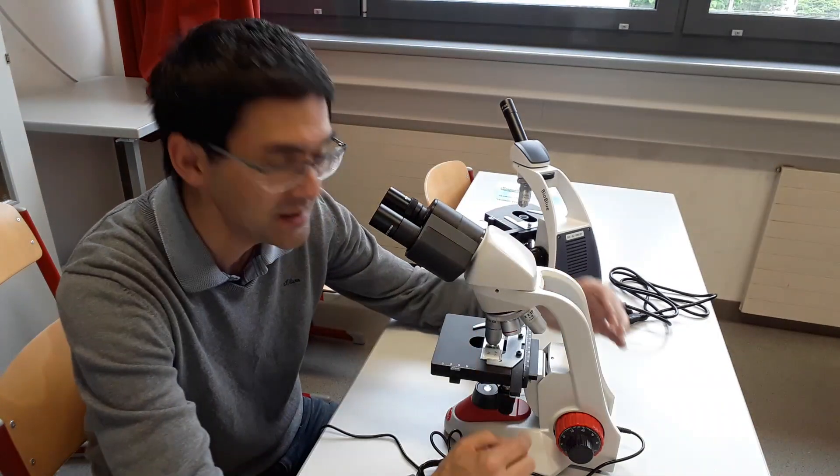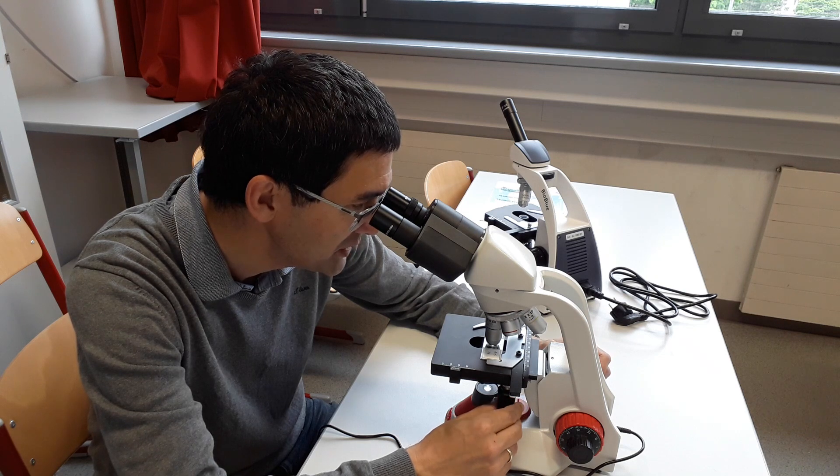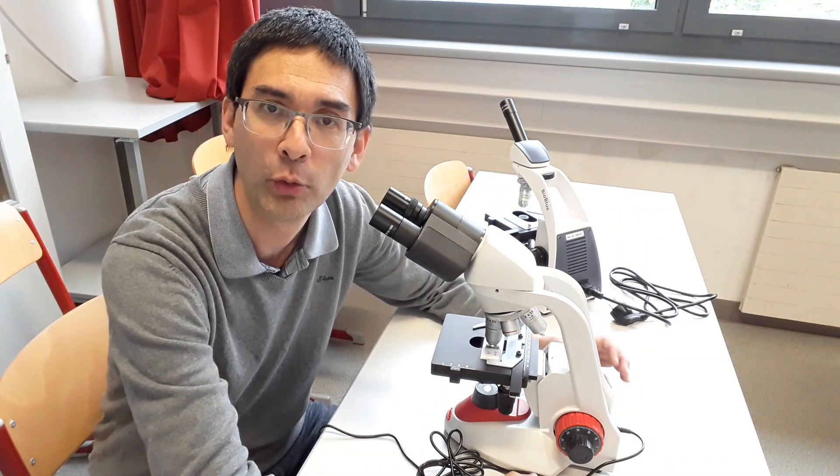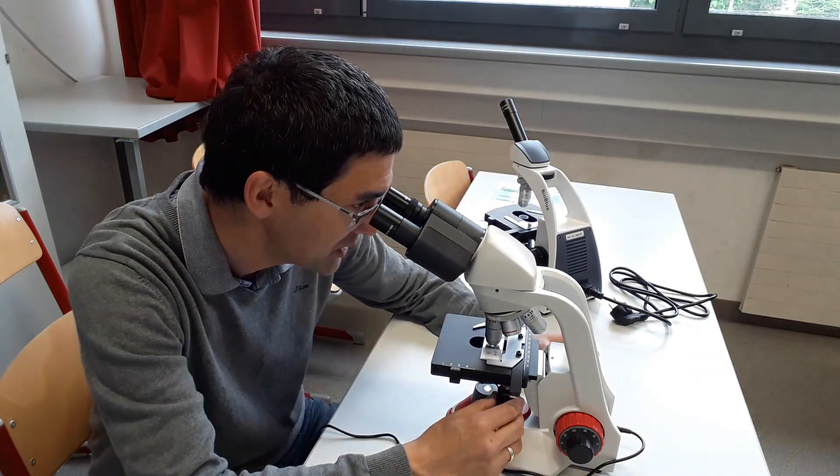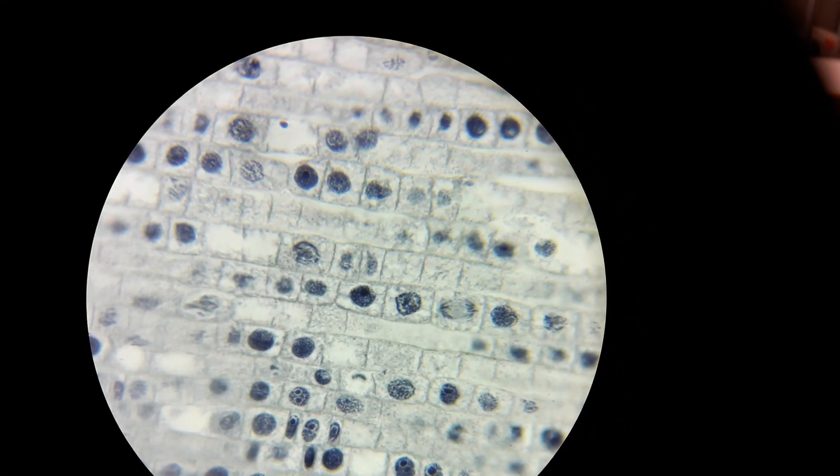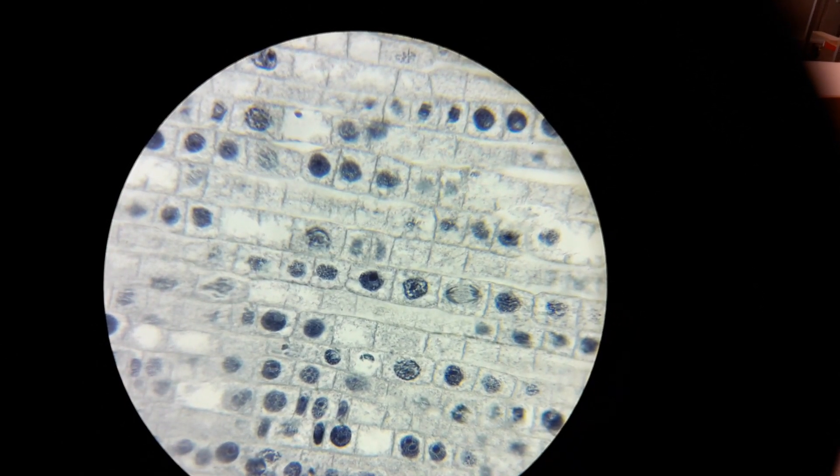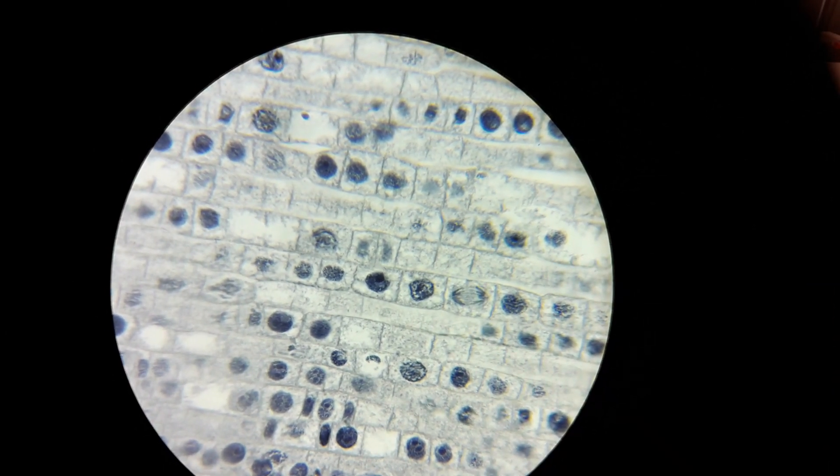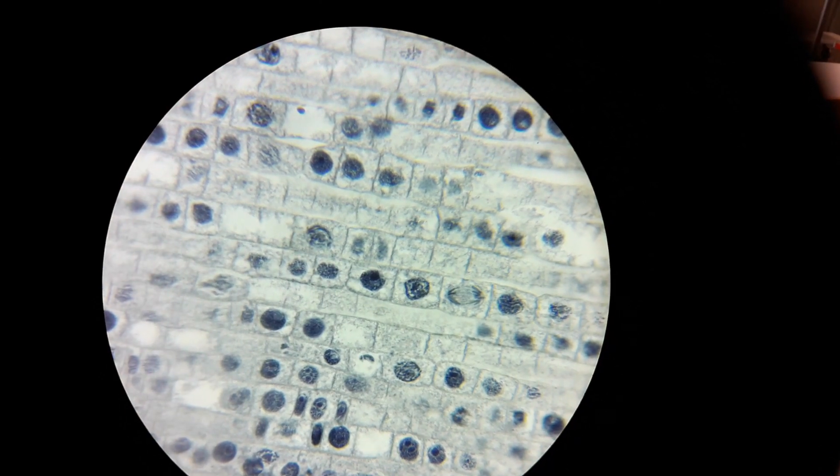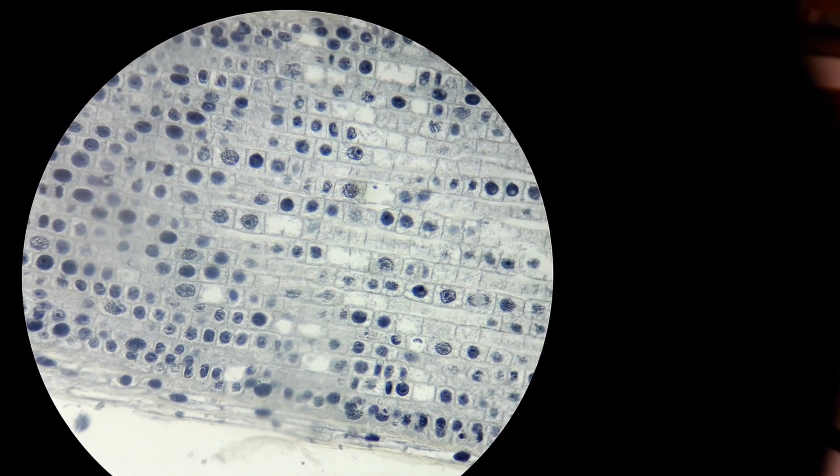And here, I'm now using the 60 times magnifying objective. And this is, of course, that is nice. Honestly, I think what we should do is we should probably get them in any case, regardless which one we're going to choose, we should get one with a 60 times magnifying objective, giving us a total magnification of 600 times, because then we can actually see the cell divisions very clearly. This does take a little bit of patience, of course, but these are now the cell divisions. So you can see that if mitosis cell divisions are supposed to be taught in school, and if you want students to actually look at these cell divisions, then I think the magnification is quite nice to have a 60 times 10 with a 600 times total magnification. And this is now using the 40 times magnifying objective, and you can still see that it also works quite well.